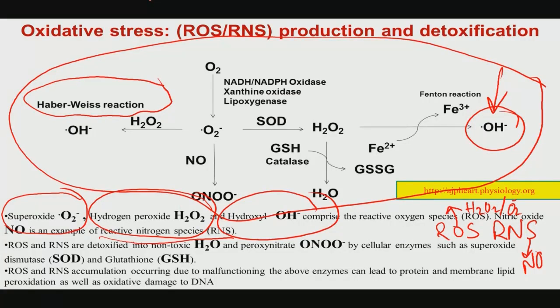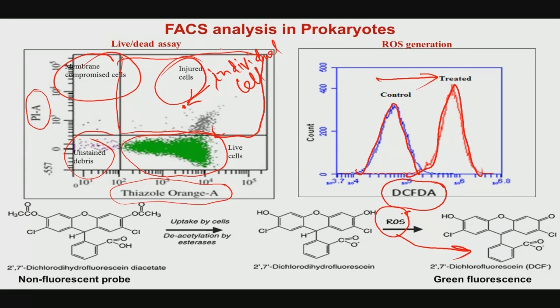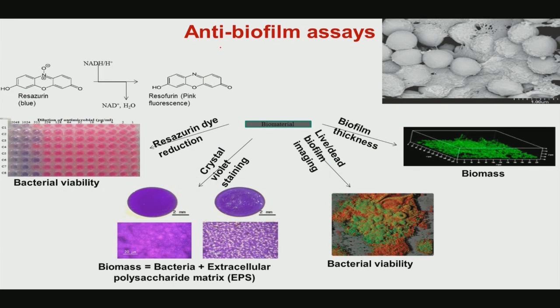Now, to support your rationale or logic, you have to do some additional assays to confirm both qualitatively and quantitatively that it is indeed because of membrane permeabilization or loss of membrane integrity that the bacteria is being killed in contact with the materials, or is not able to grow once it comes in contact with these materials. And also a more biological or biophysical origin can be reactive oxygen species, which you need to quantify using FACS. Up to this part it is done, so then you confirm the antibacterial effect.